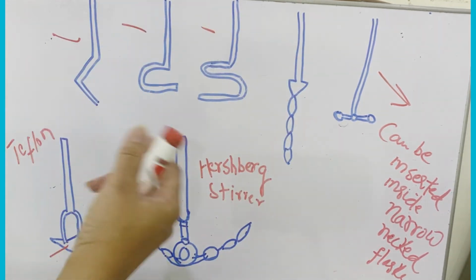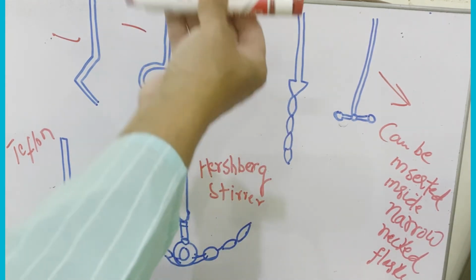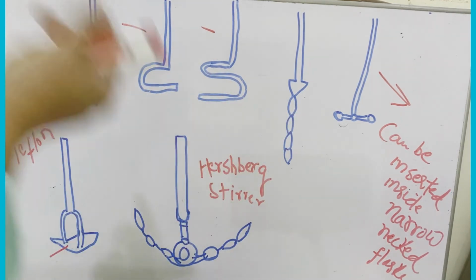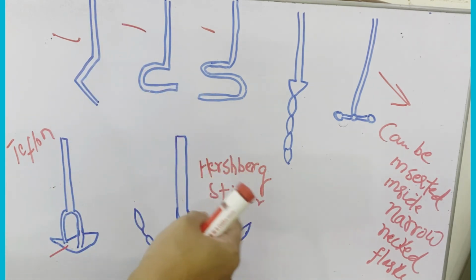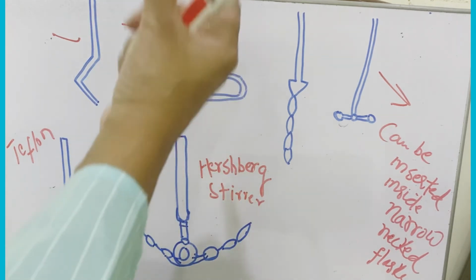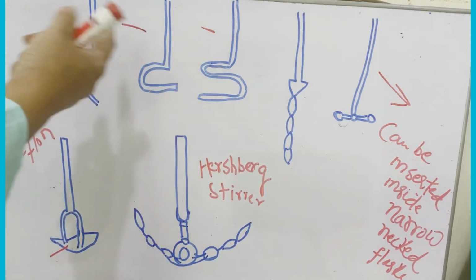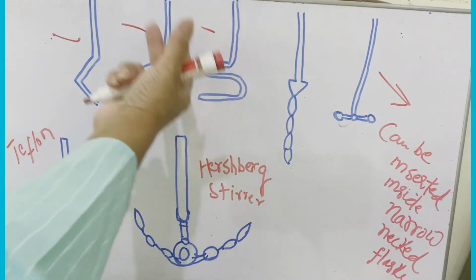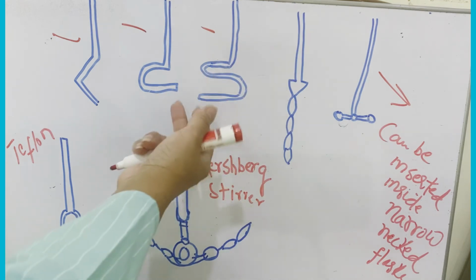Even a student in the lab can bend the glass by heating it over a hot flame, and you can bend it in your desired direction, into the desired shape of the stirrer you need. So you can make it on your own also. A capable student can make a stirrer of its own choice or shape needed in the recommended experiments.